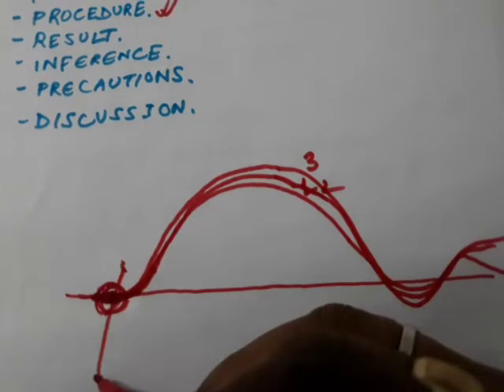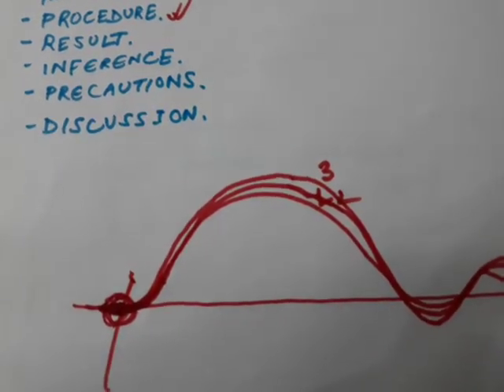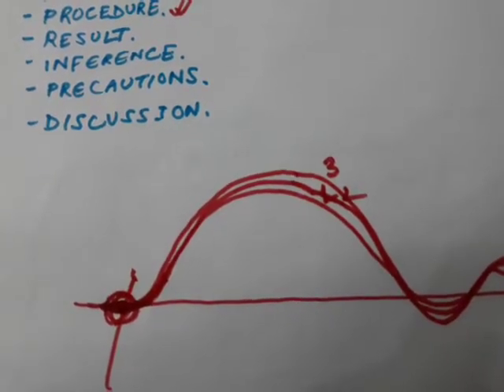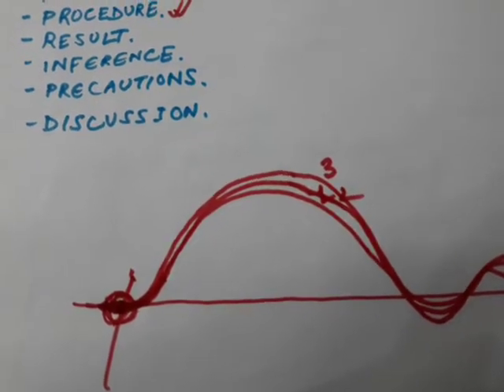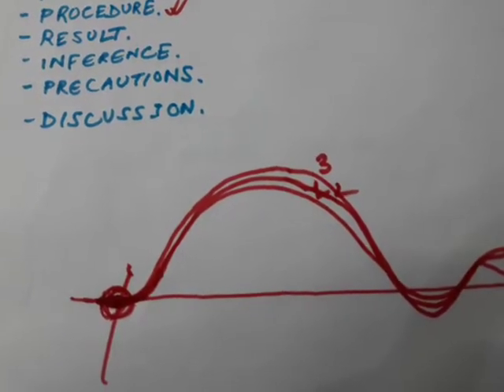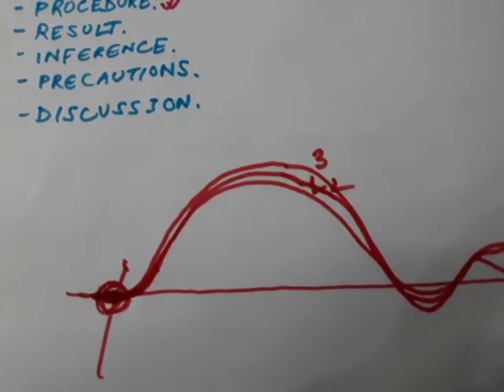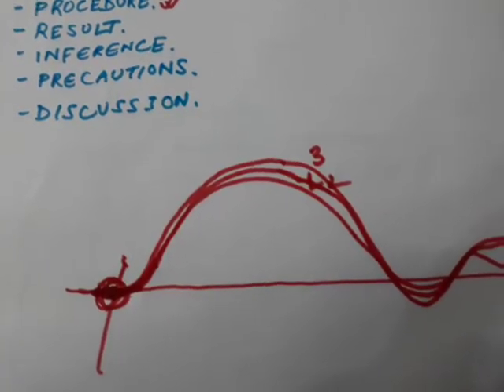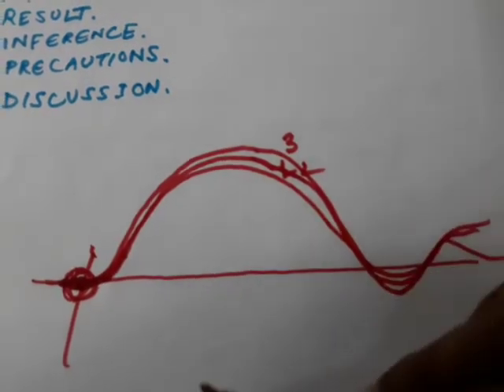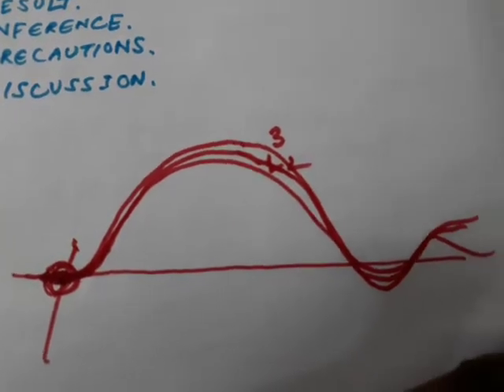Now in the next phase we will stop the drum and mark the point of stimulation. Then, keeping the point of stimulation the same and moving the writing point away from the drum, we allow the drum to rotate and stimulate the nerve repeatedly by keeping the tap key pressed, so that the preparation is stimulated once during each rotation. Now the fourth, fifth, sixth, 7, 8, 9, we will stimulate the nerve, but we will not record it.